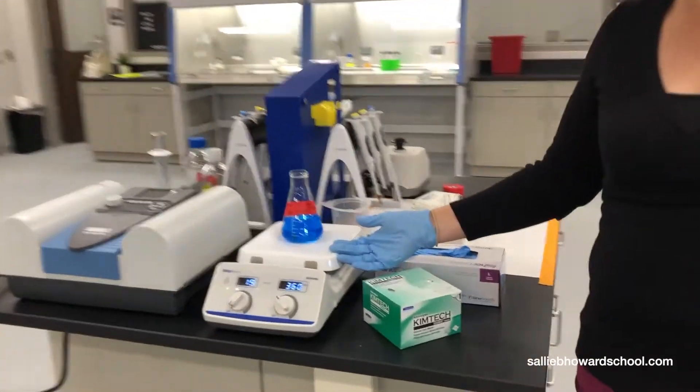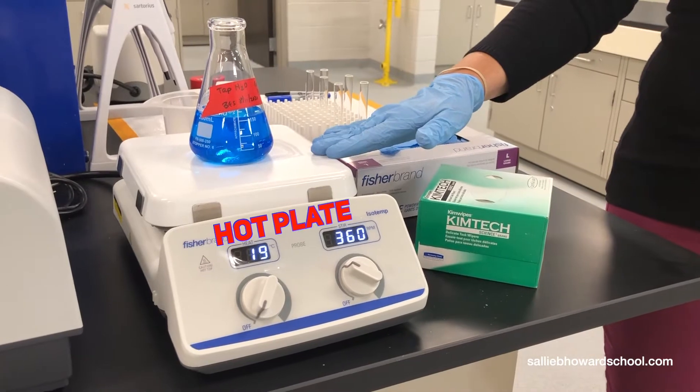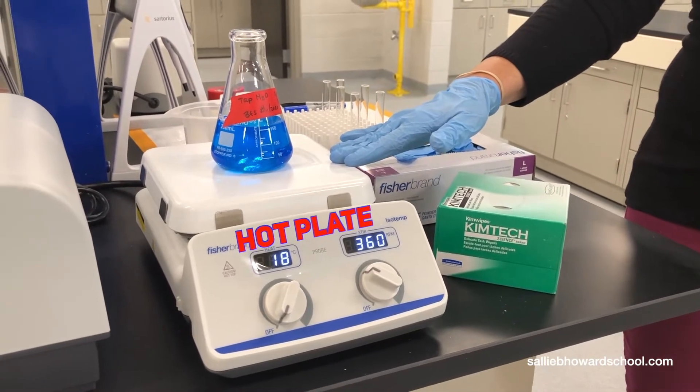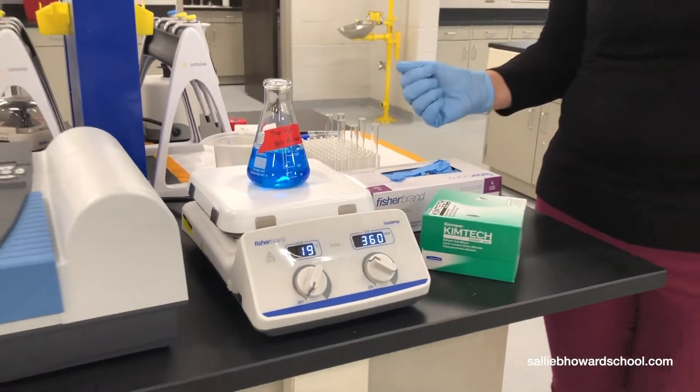Then maybe they have to dilute it to get to the concentration they would like. Sometimes they'll be making solutions, or maybe they need to heat or stir said solution. They would use their own hot plate — every table is outfitted with one — and as you can see, we have a magnetic bar in there that stirs the solution as they do something else.